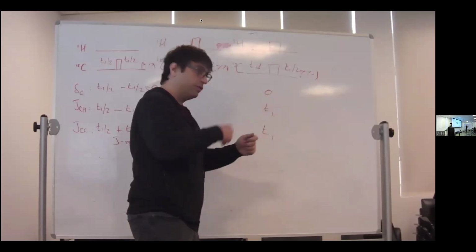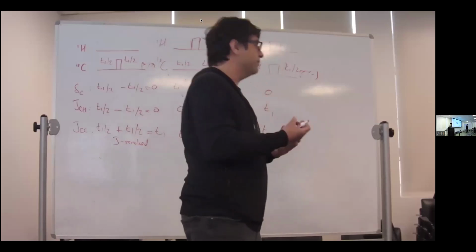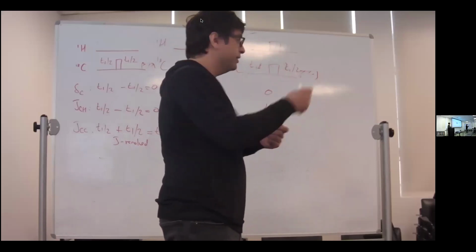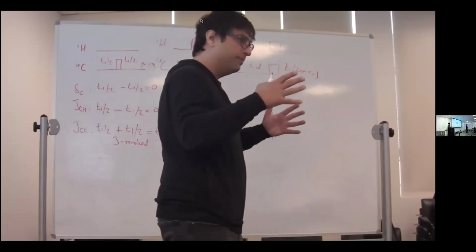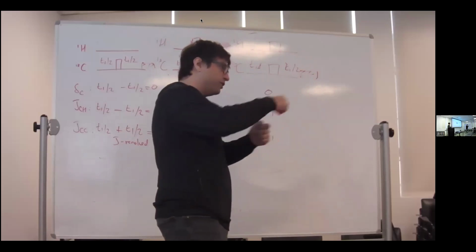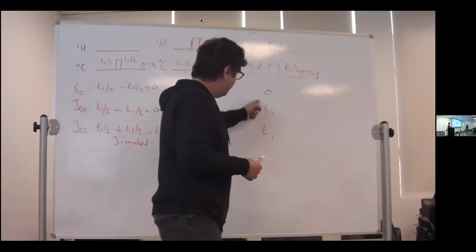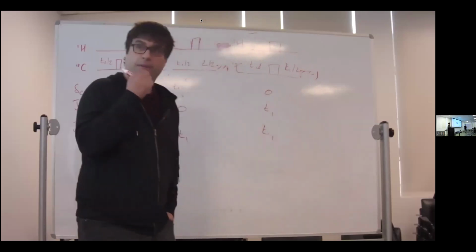So how would I, and I want to measure things in the indirect dimension because carbons enjoy, generally speaking, better line widths. Protons often will have scalar couplings to other protons or have dipole couplings to other protons so that the proton line width can be compromised. So you often want to measure RDCs from the heteronuclear by including the splittings on either the carbon or the nitrogen. Okay, but now you have homonuclear interactions that you want to get rid of. So what are two obvious ways of getting rid of carbon-carbon evolution? You could use selective pulses.